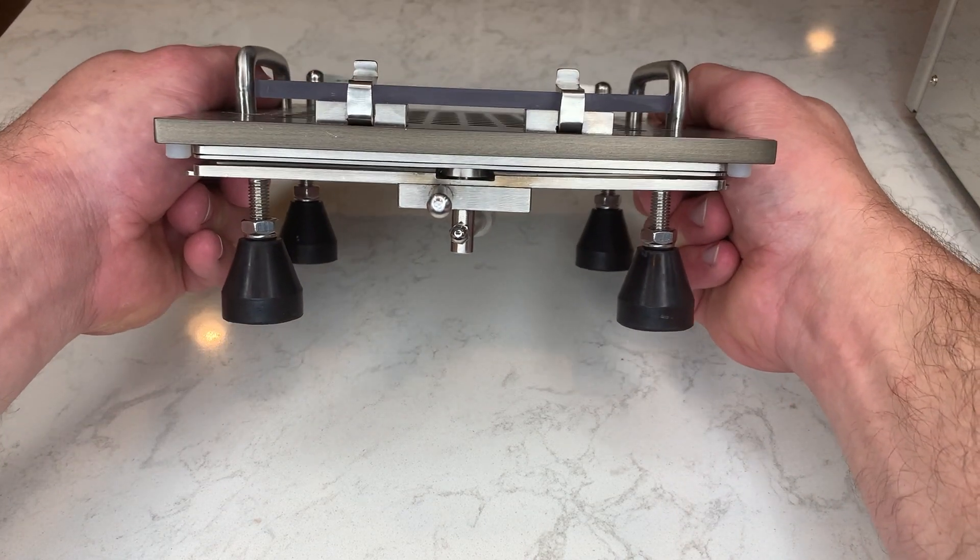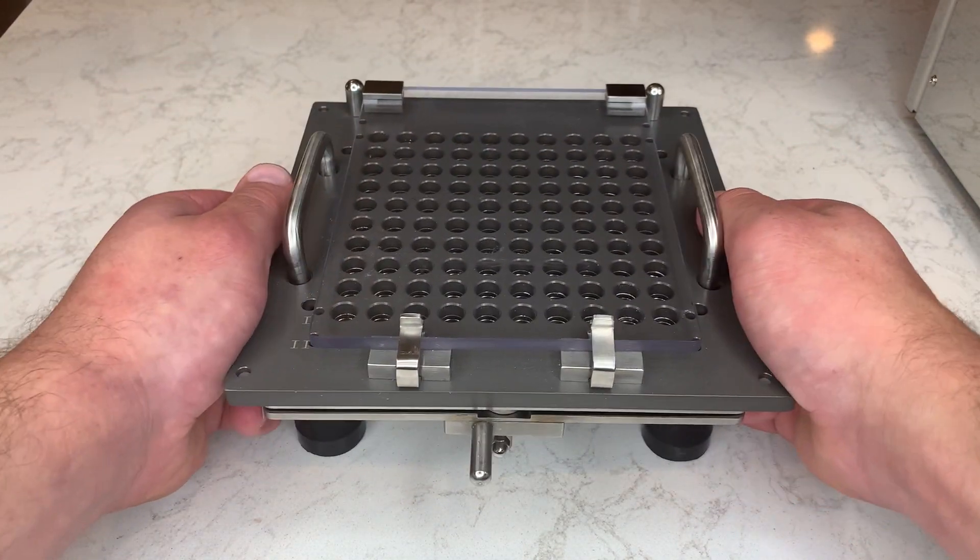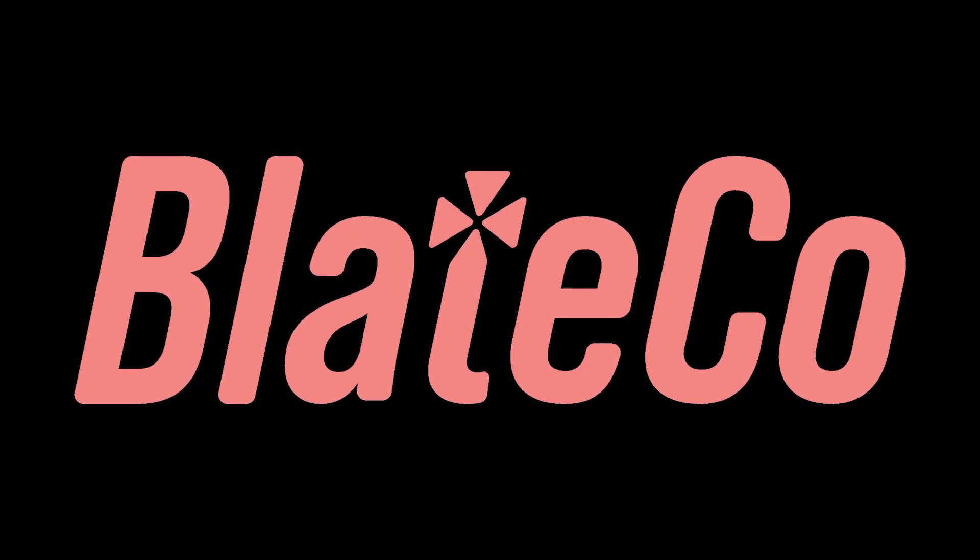Now, there's a lot more to say and learn about each machine, but this was just a quick run-through of the main differences between these four 100-hole capsule filling machines by BladeCo.